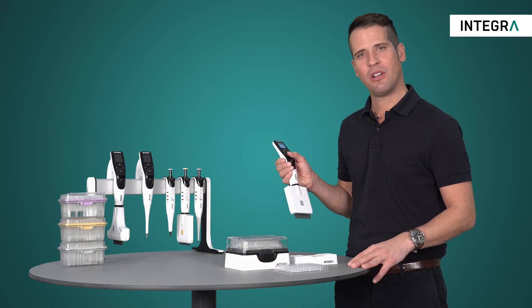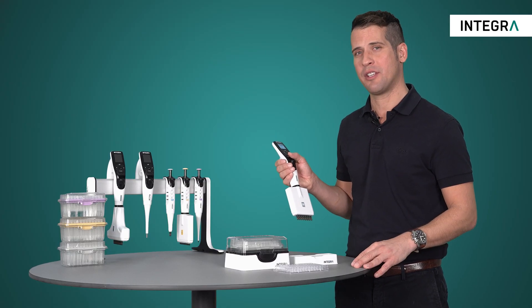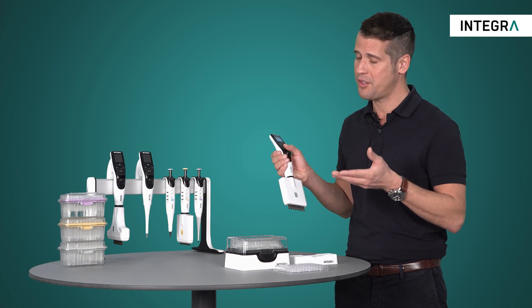With repeat dispense mode, you can really see some major benefits of using an electronic pipette versus a manual pipette.